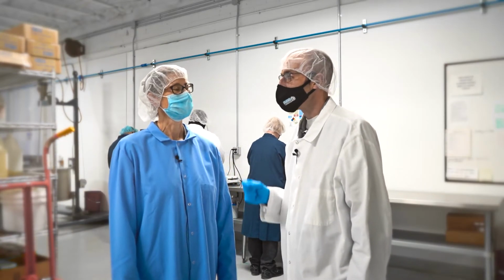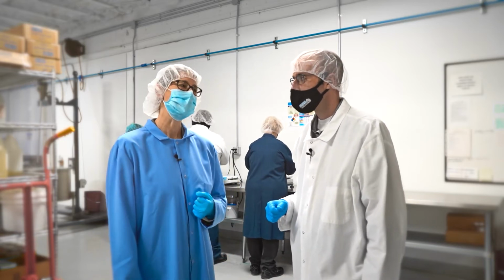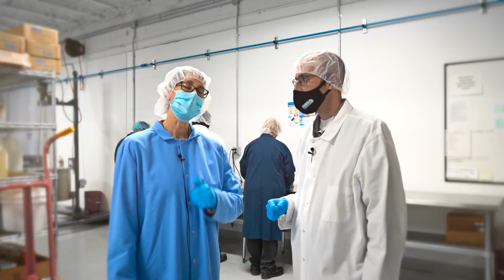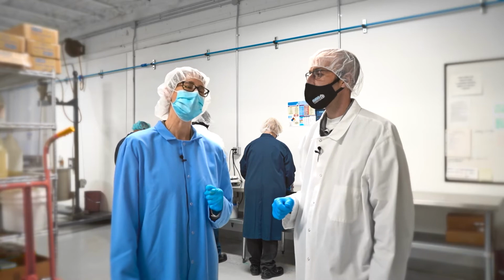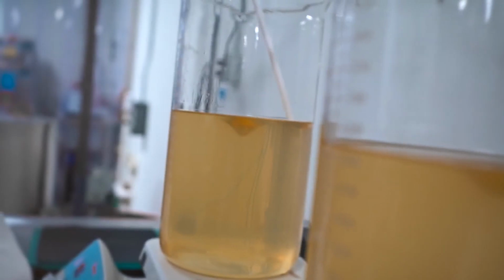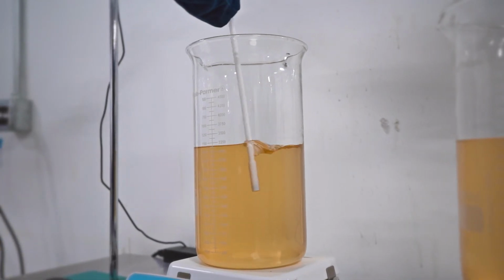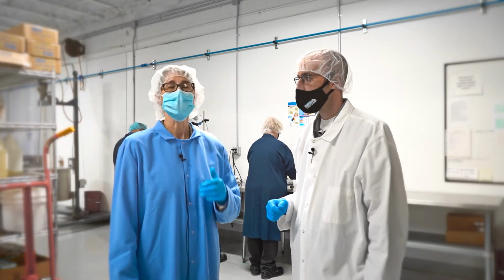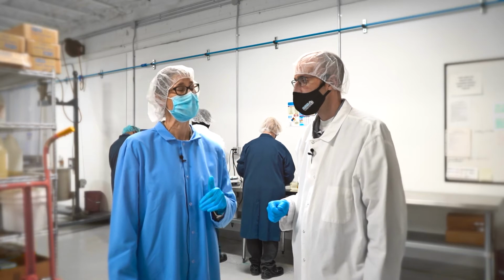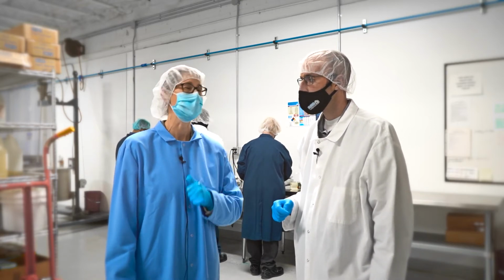How do they ensure that the mixture is the same every time? Great question. As part of our quality control process, our R&D formulation scientists create a batch record that is specific for every single product. On that batch record, we include the specific ingredients, how much of each ingredient to include, and then how to mix, weigh, heat, and what the final outcome is supposed to be. And so our formulation technicians put those together on a day-to-day basis, follow a batch record every single time. And for every single product that we've ever made, we have a batch record that's available.